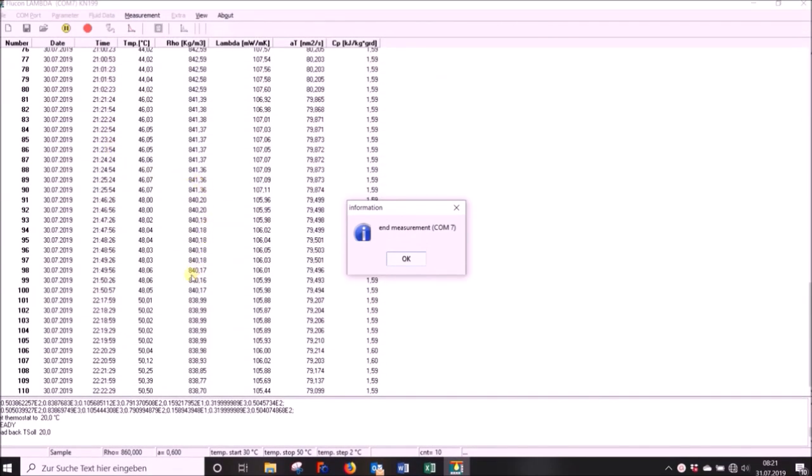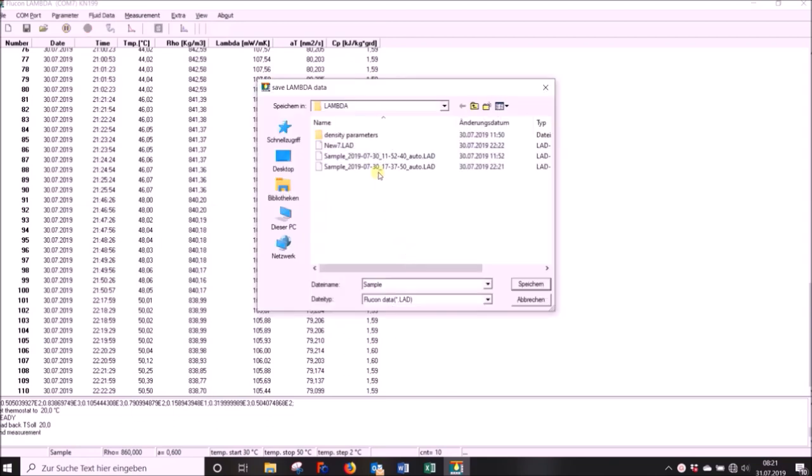When your measurement was successful, a message will be displayed. Click on OK and you will be given the option to save your protocol to a directory of your choice.